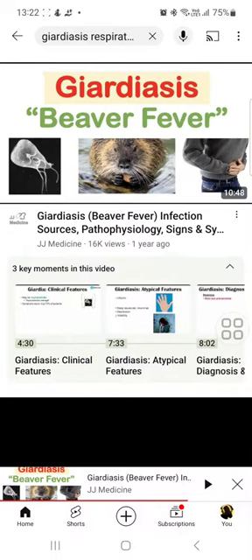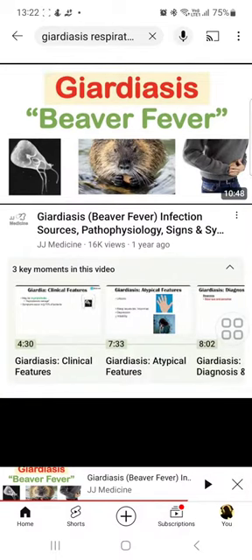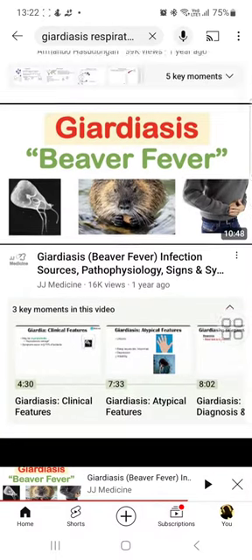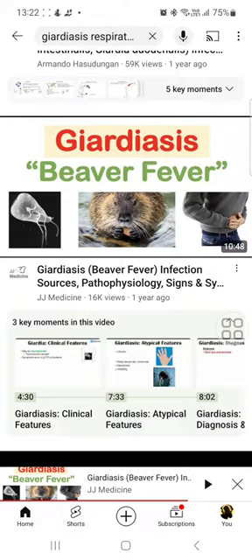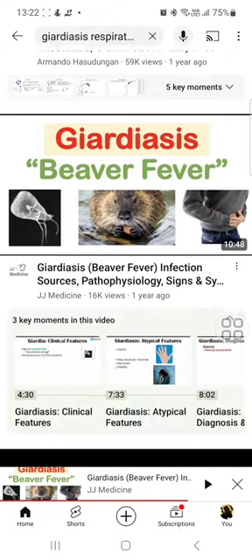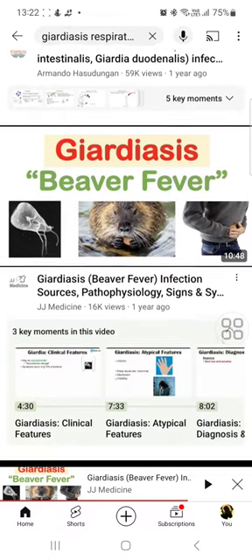One is the cystic form, the other is the trophozoite form. The white organism with black background — that is Giardia, and that is the trophozoite form.